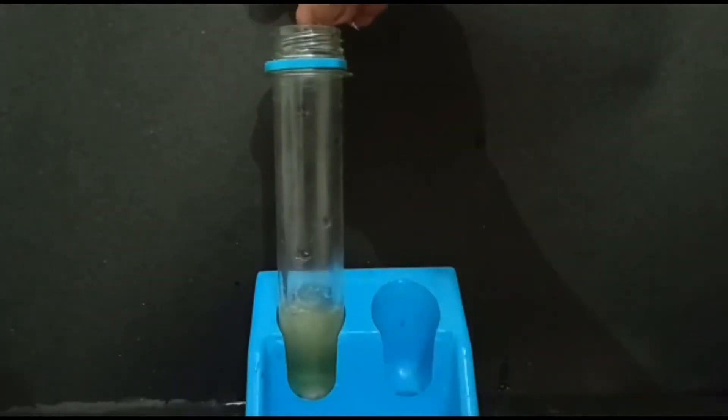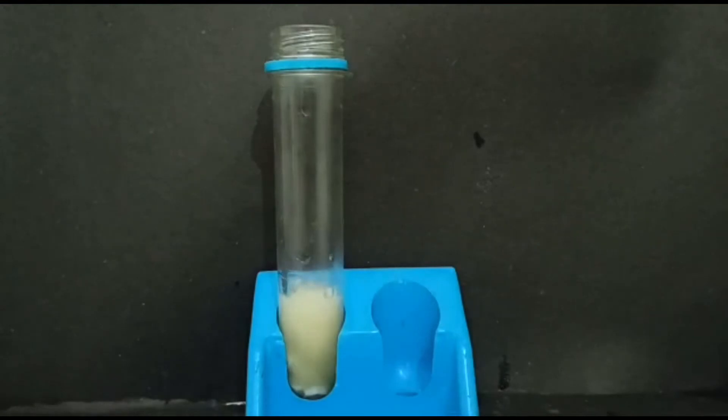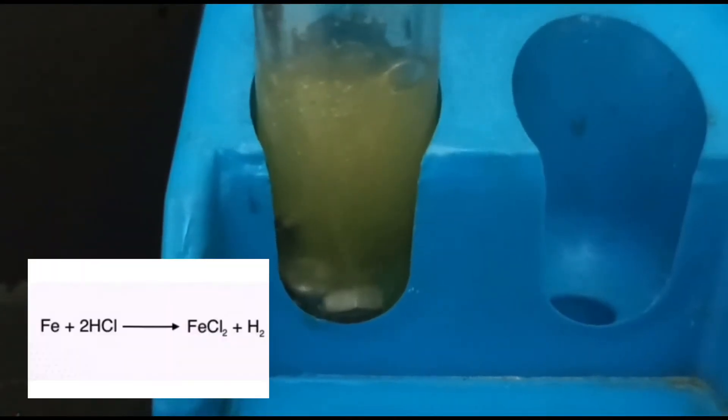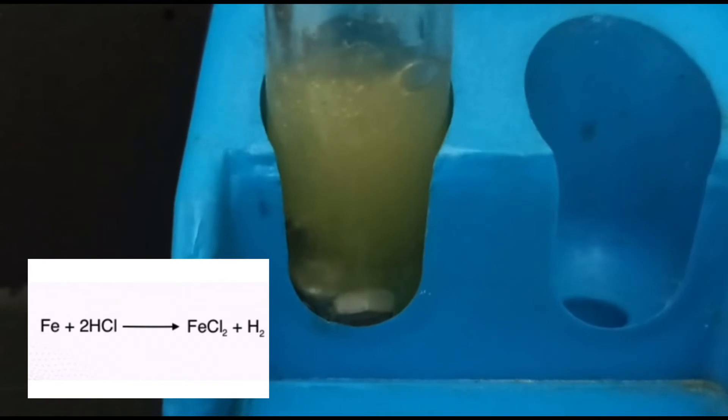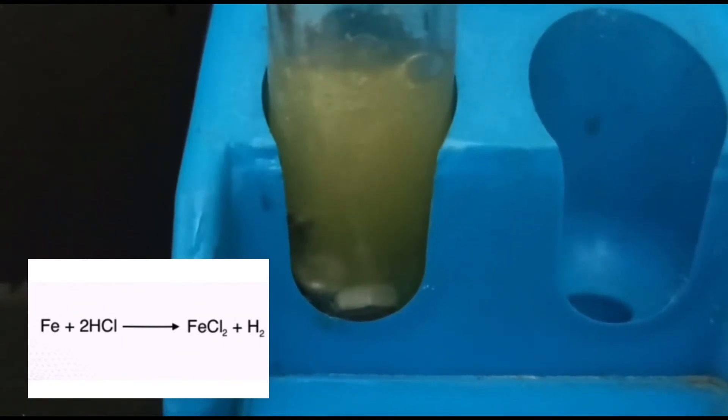As soon as the iron is added, the HCl reacts with the iron to make ferrous chloride and hydrogen gas, which you can see bubble out. The ferrous chloride solution is green in color.